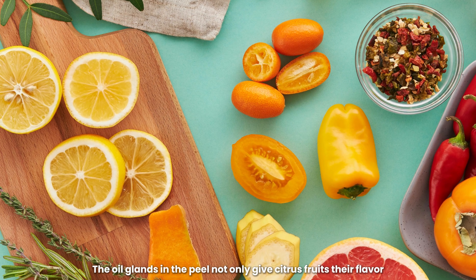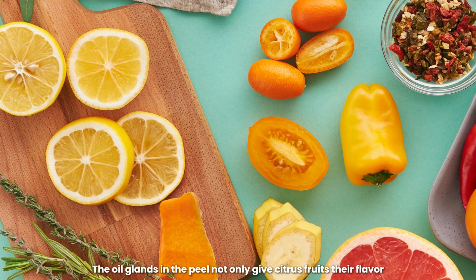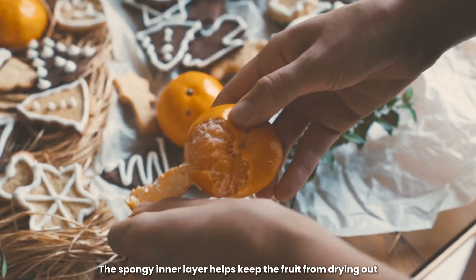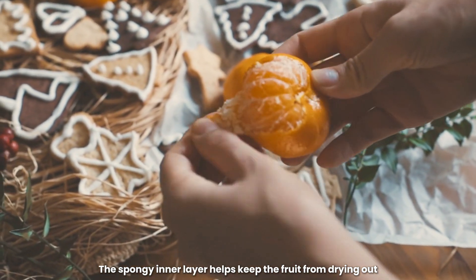The oil glands in the peel not only give citrus fruits their flavor, but also help protect them from insects and diseases. The spongy inner layer helps keep the fruit from drying out.